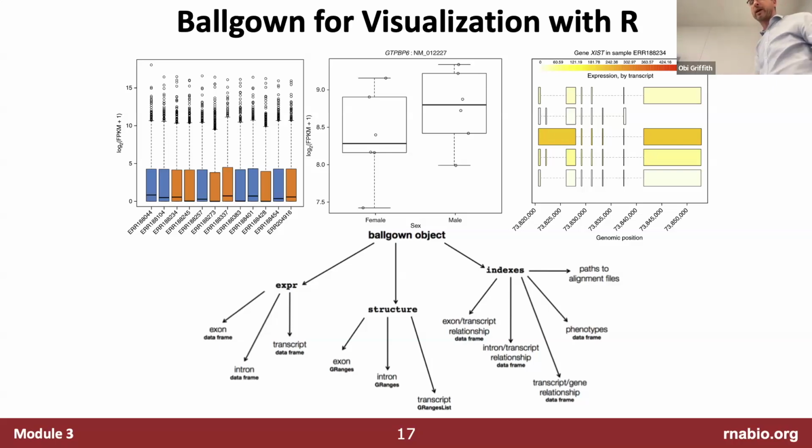That we're going to actually get transcript level expression estimates, and there are some nice visuals to see, okay, for this gene locus, there are 5 transcripts with these different structures, and it's especially this particular isoform that we're mostly measuring, but we're also getting low levels of these two and almost none or negligible levels of these 4th and 5th isoforms. And if you're really interested in the biology of this gene and these proteins from these different isoforms, that level of information might be incredibly important to you. And this might be a nice way to visualize it.